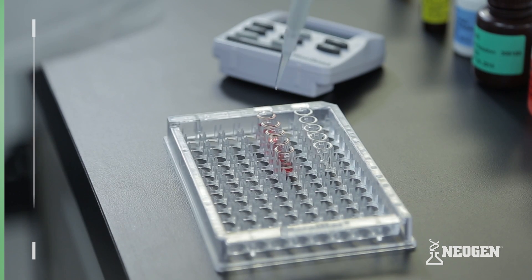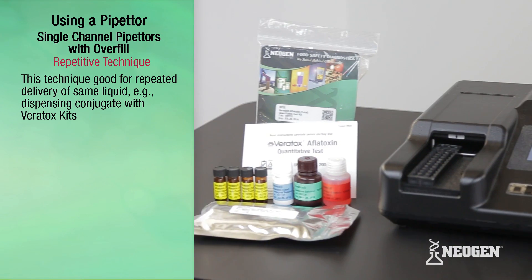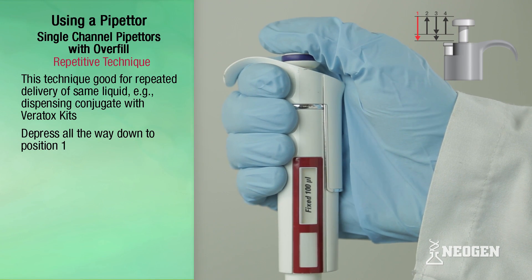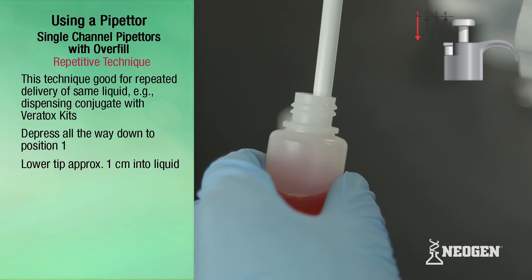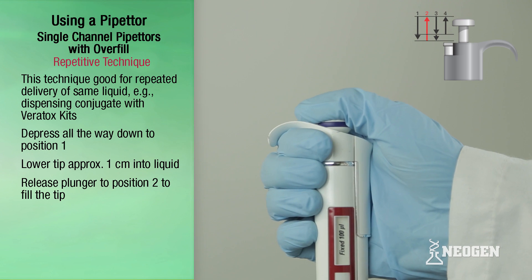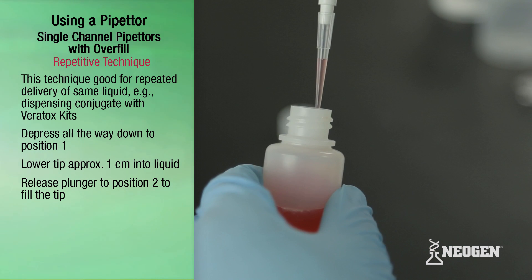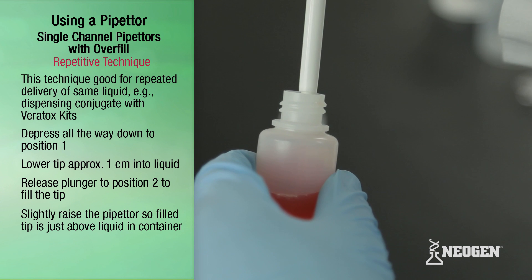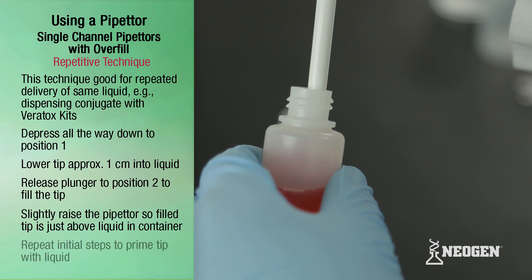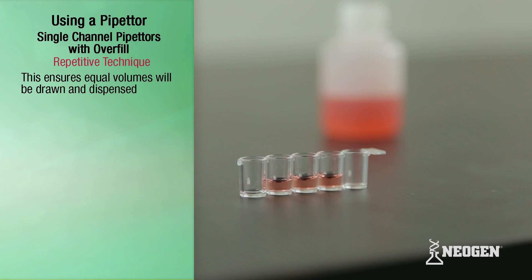Repetitive technique. This technique is good for repeated delivery of the same liquid — for instance, dispensing conjugate with Veratox kits. Slowly depress the plunger all the way down to position one and lower the pipetter so that the tip is placed under the surface of the liquid to about one centimeter. Slowly release the plunger to position two to fill the tip. Slightly raise the pipetter so that the filled tip is just above the remaining liquid, and repeat these steps to prime the tip, which ensures equal volumes are drawn and dispensed.